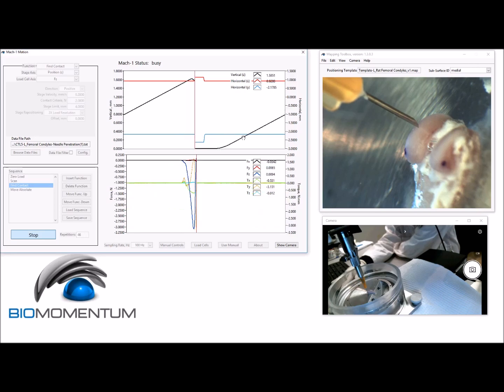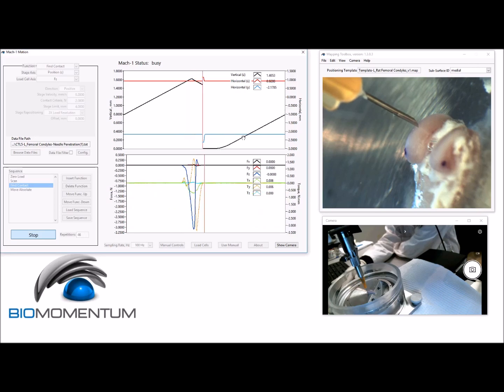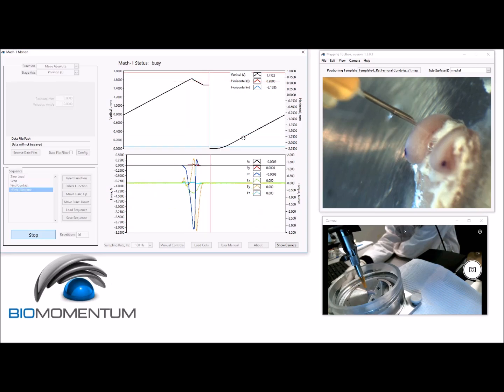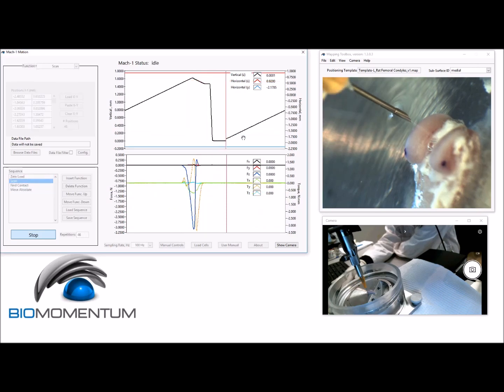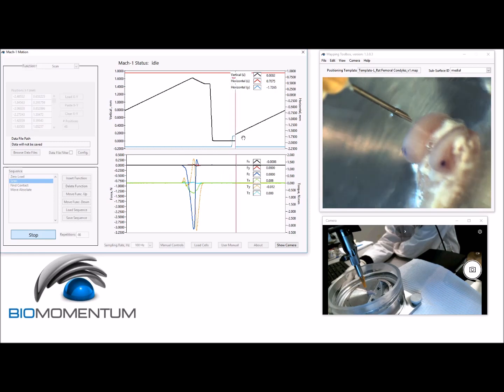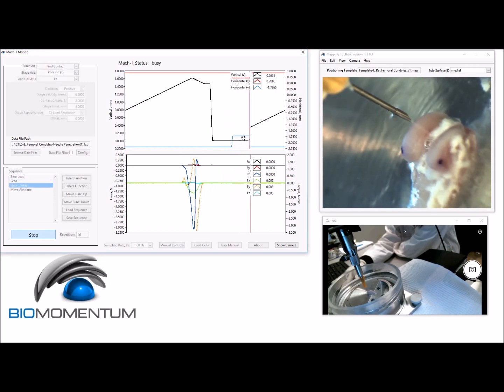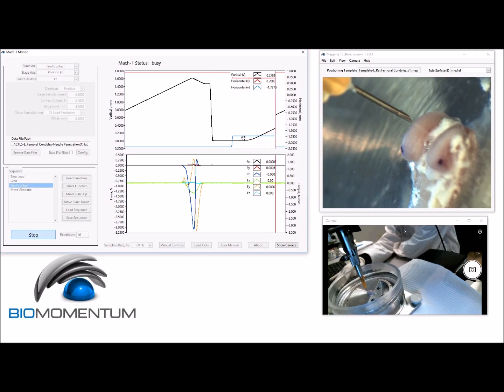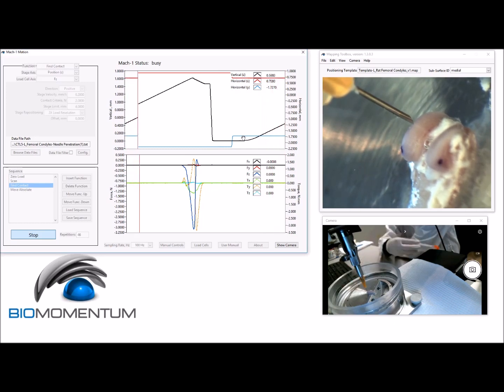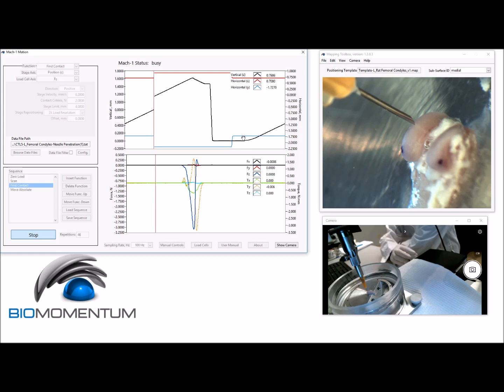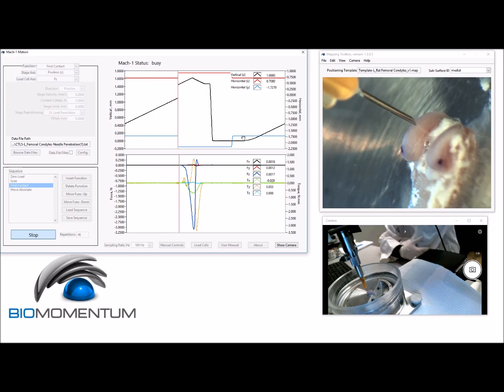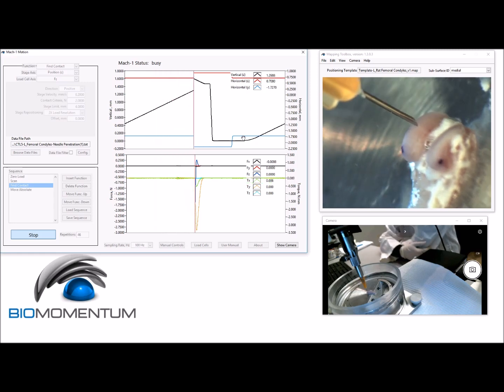A needle is installed under the load cell and is vertically displaced towards the sample at a constant speed until a predefined maximum load is reached. The needle touches the cartilage surface when there is a slight increase in the load, while it touches the subchondral bone when there is a sharp increase in the load.